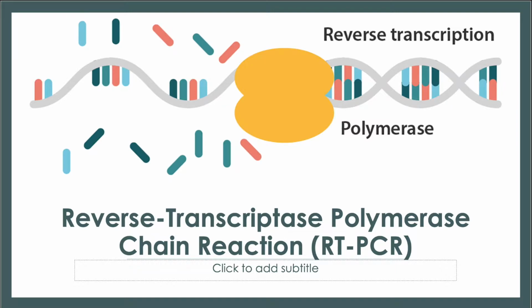So what is PCR and RT-PCR? Basically, RT-PCR is an offshoot of PCR, a modification. Instead of DNA as a starting material in PCR, in RT-PCR we use RNA as a starting material to create the amplicon that we desire.